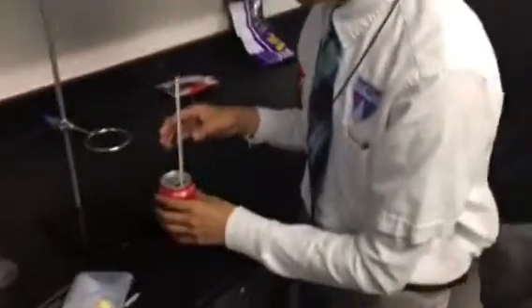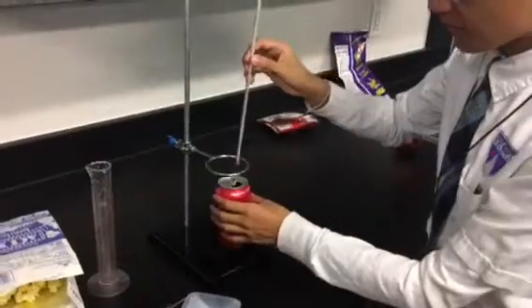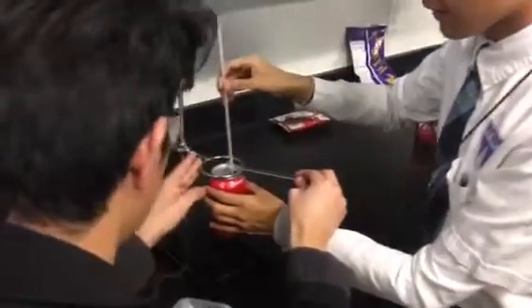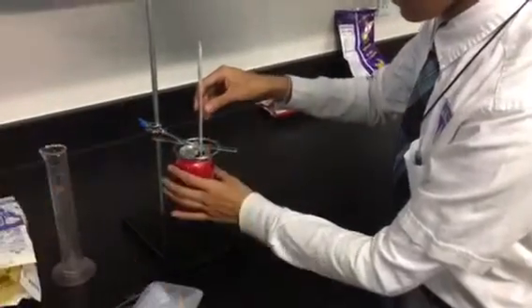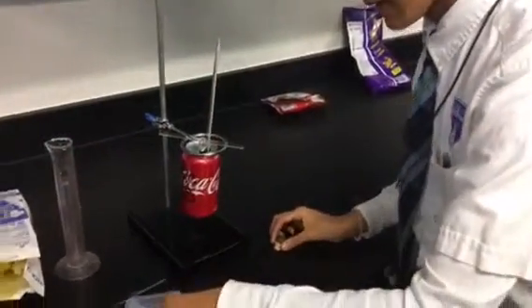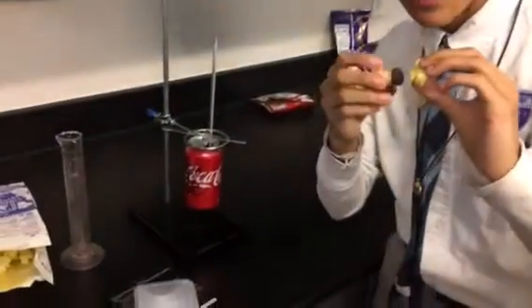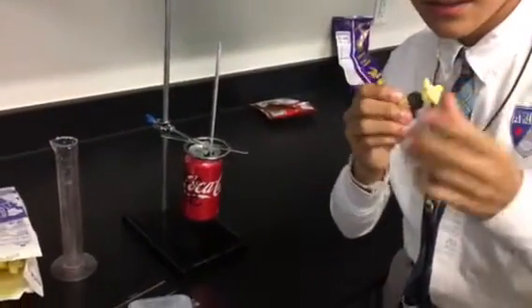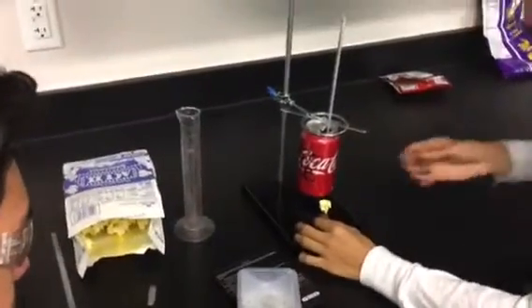It says center the food holder under the soda can and light the food sample. Put the food under the can.